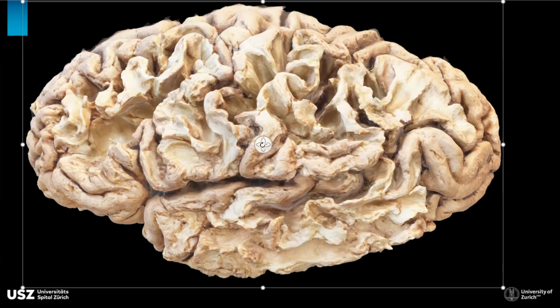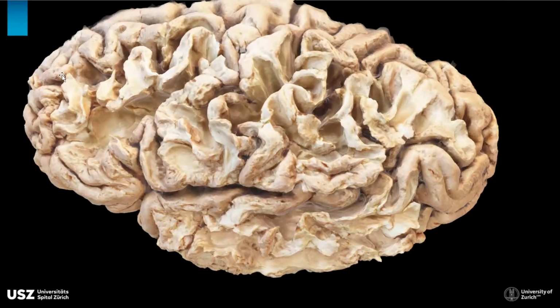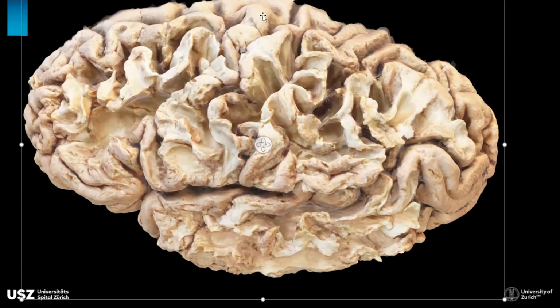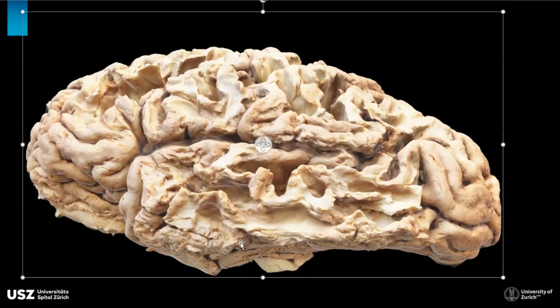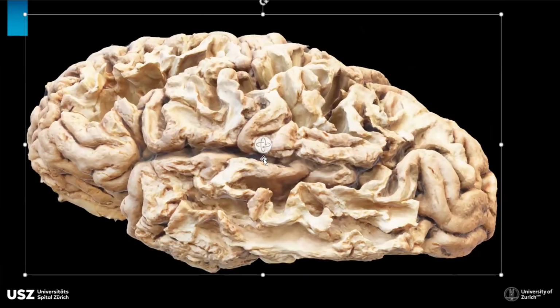In the end, what you will obtain is this. All of the brain decorticated, apart, if you want, from the most external part consisting of the superior frontal gyrus, central region, superior parietal operculum, occipital area, and then inferior temporal gyrus. Opercula must also be spared. Okay, so this will take 2 hours. Do it very slowly. We will help you. Also, the guys very experienced in dissection will help you in these steps.